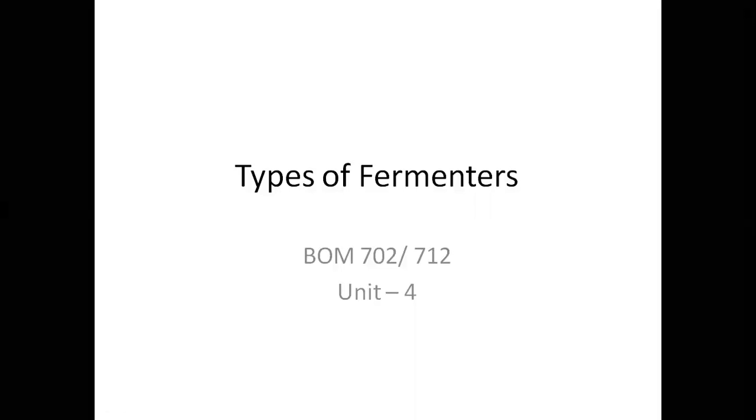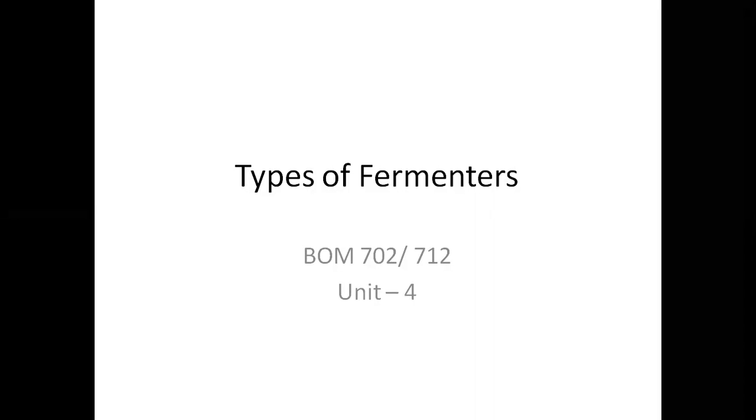Okay, good morning, students. Today we'll be discussing the types of fermenters or bioreactors in which the various industrial fermentation processes are carried out to form industrially important products and manufacture different things like alcohols, different solvents, enzymes, antibodies, amino acids, etc. And also the fermenters which are utilized in wastewater treatment and other such different varieties of processes.